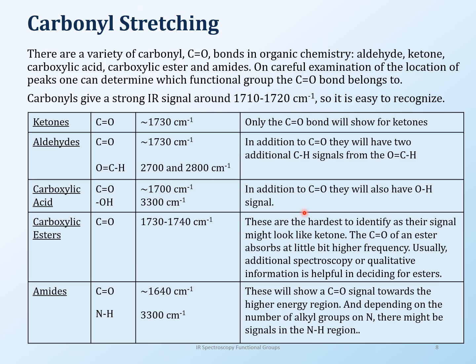Okay, carbonyl stretching. Carbonyl is going to be the fun one because there are so many carbonyls, right? There's a ketone, aldehyde, and so on and so forth, okay? And all of these come around the same place. So this is something that you need to understand, how they are working. For example, ketones are very simple. You will see only one peak and that's it. You're done around 1730, 1720. And I will always write this as around because things can shift a little bit here and there. It's not that you will always see exactly 1730. No, things can shift. So I will always write approximately.